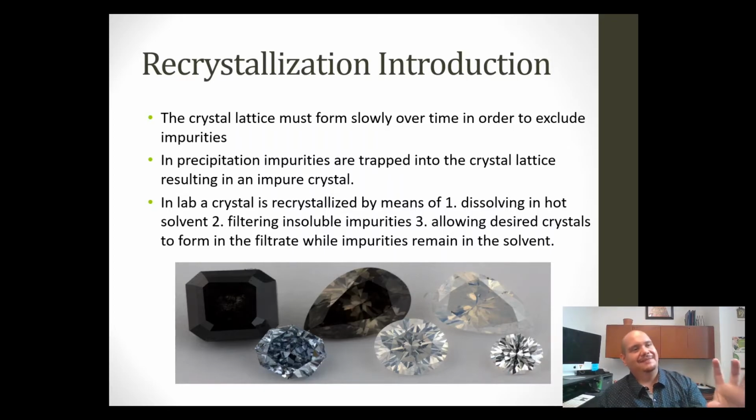So if you're looking at something and it's bright yellow, you say, oh yeah, that's probably a contamination. Unless that crystal by nature has a bright yellow color, and some do. And that's important to remember. You should write that down. Some crystals actually do have color. They actually do have pigment.